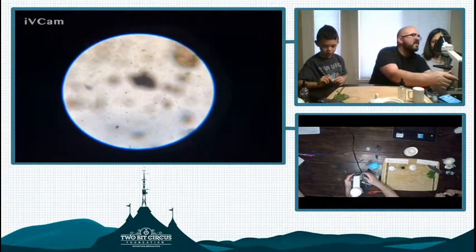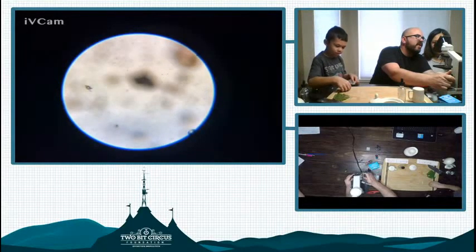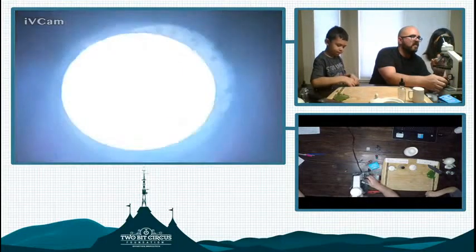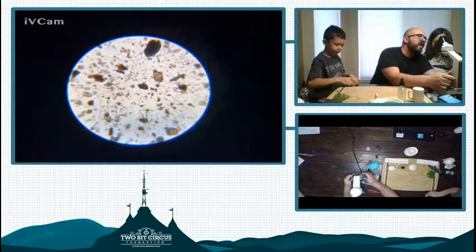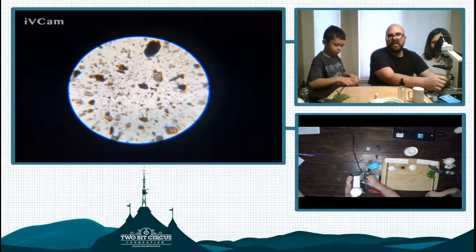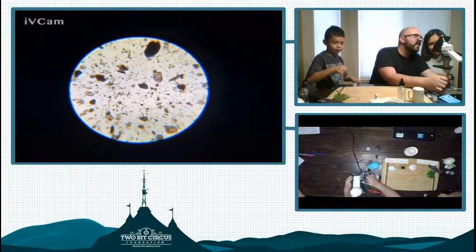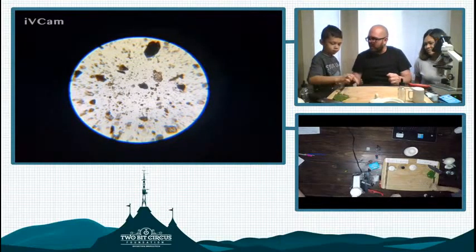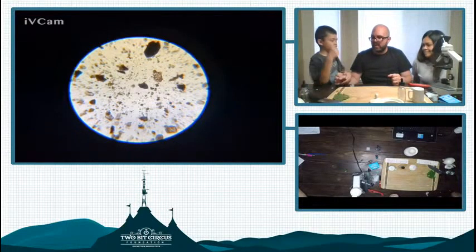Ooh, not too fancy. So we just added a little bit of water to the dirt here, to separate the dirt out a bit. And I'm pretty comfortable saying that our dirt is not alive. I don't see any cells in there, Robert, or any cellular structure. Do you?